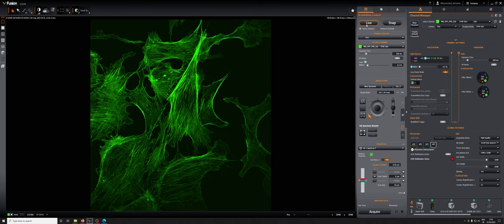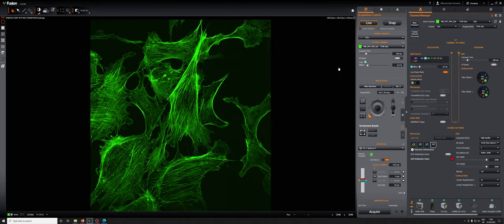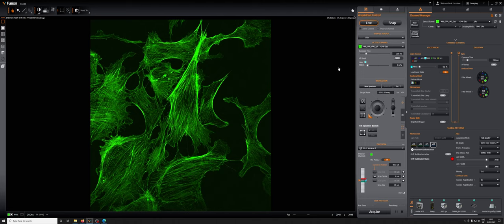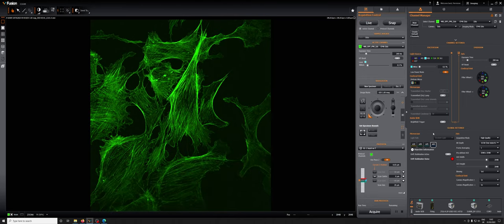If we go to live we can see this is what it looks like and that's what I had snapped a picture of just a moment ago. Now we can increase the magnification in this image by going down here.